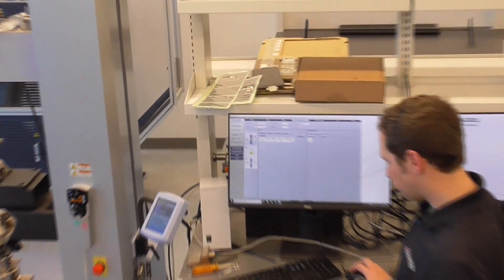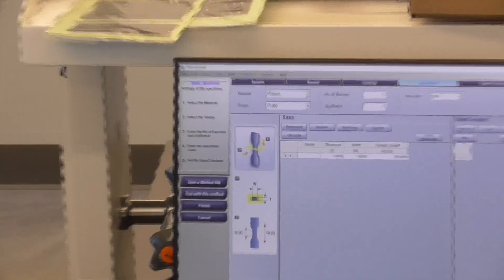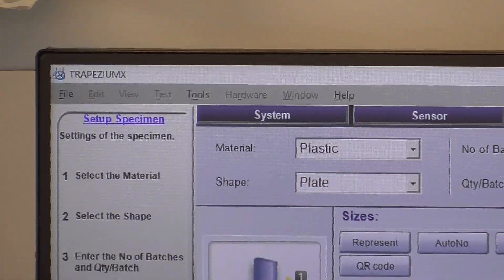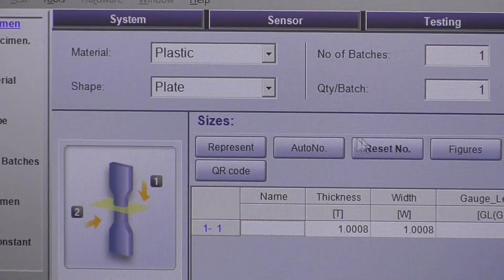Alright, moving on to specimen. So here's where you put in your sample material, your sample shape, and also the dimensions of your sample.